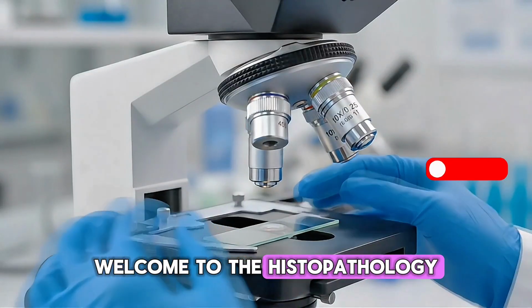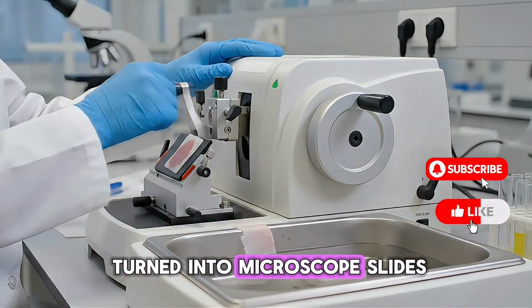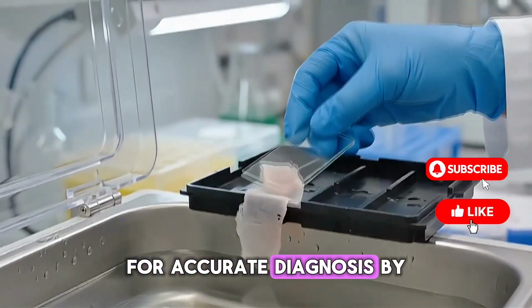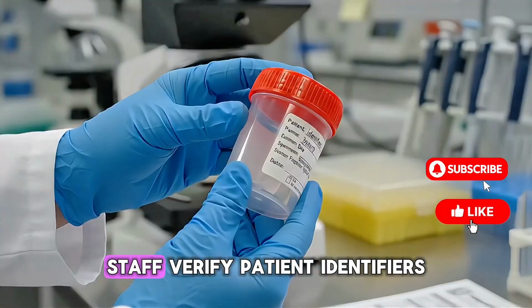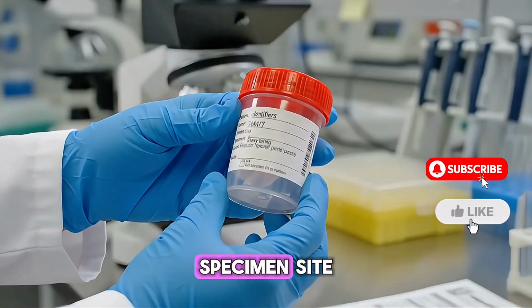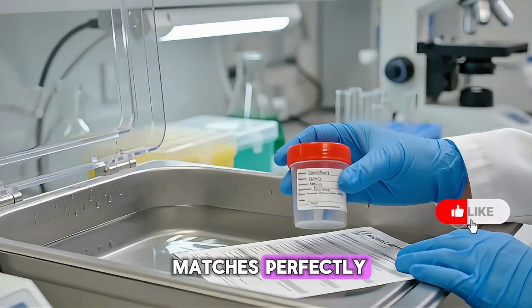Welcome to the histopathology lab workflow, where patient tissue is turned into microscope slides for accurate diagnosis by a pathologist. First, the specimen is received. Staff verify patient identifiers, specimen site, and request form details, and check that labeling matches perfectly.